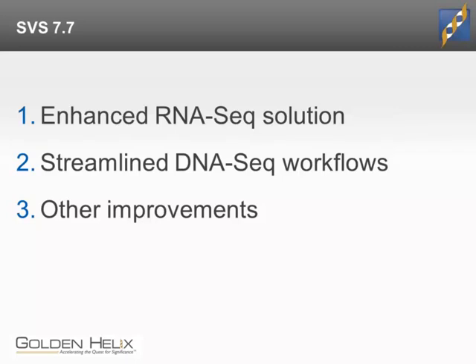Today I will demonstrate our enhanced RNA-Seq solution, our streamlined DNA-Seq workflows, and a few other important improvements to SVS. Throughout this webcast, I will be mentioning several features that are discussed in detail in tutorials and the SVS manual. Please feel free to consult these resources for further information and technical details.